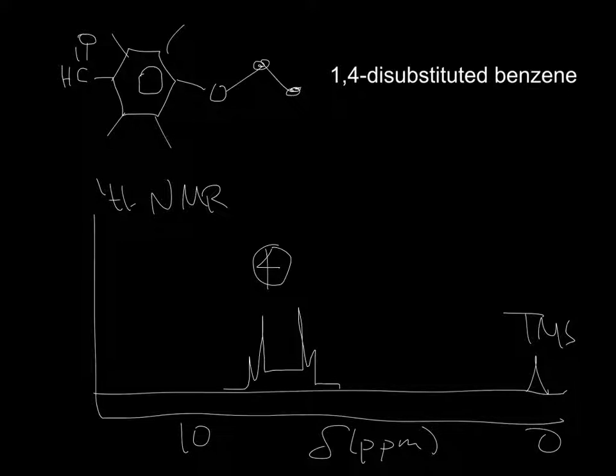And then I want you to put the other ones in with respect to that benzene ring. First of all, how many other groups of hydrogens are there total, after we took out the benzene ring one? 3, okay? And none of them are identical. Technically it's called 3 chemically non-equivalent environments. Which one's going to be closest to TMS? The methyl group, okay? I'm going to give it this color right here. What number will it integrate to? It's going to integrate to 3.